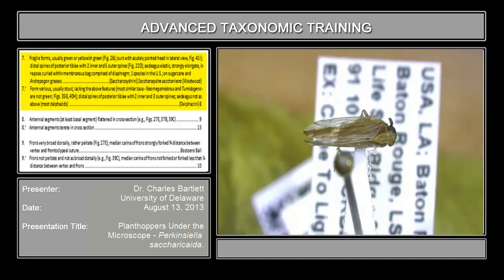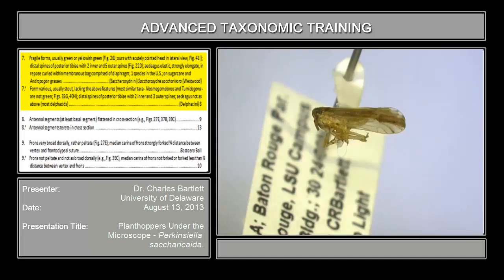Continuing on, with an acutely pointed head in lateral view — is this head acutely pointed in lateral view? No, it is not. The next part of the couplet tells you about the posterior spines on the hind tibia and the nature of the aedeagus, none of which we have to look at because none of that will apply to this specimen. This specimen goes the other direction where it reads: form various, usually stout, lacking the above features. So that brings us to the tribe Delphacini.